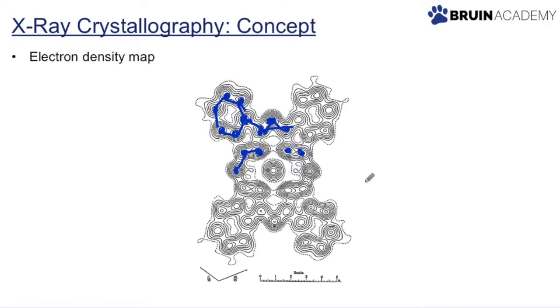Okay, so those are the very, very basic concepts of X-ray crystallography. Again, it's not really a big component of organic chemistry. It's not as important as things like IR or MS in terms of the course, but it is a very interesting area of study, and it's really helpful in terms of understanding the spatial information of a molecule. Okay, but just keep in mind it can't tell us things like molecular formula and such because it's more focused on space, basically.